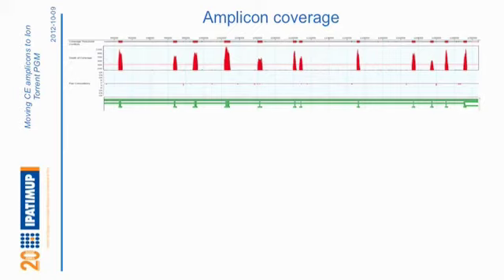So the first look that we have at our samples, on our runs, is to get a feeling of the coverage of all the different amplicons. And this picture here just shows you what we are really sequencing. It's a pity that I don't have a pointer so that I can show you. But the red bars are the distribution of the depth of read.